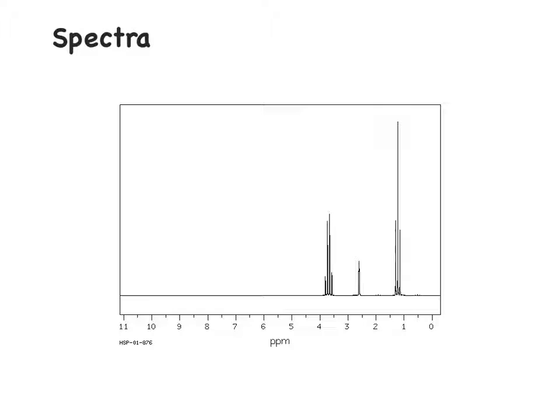This sample actually goes into too much detail. This is more a high level NMR, and we actually have peak splitting. Now, peak splitting is covered in the high level course, but we don't have to do it. But from this, we can obviously see that there are 3 different ways that hydrogen exists in this molecule.